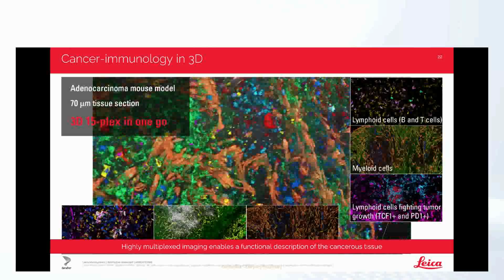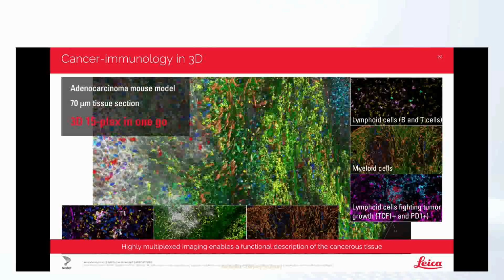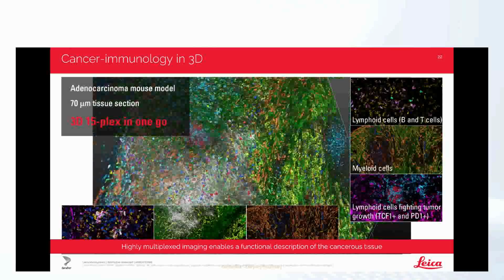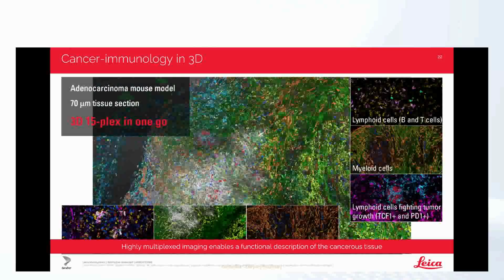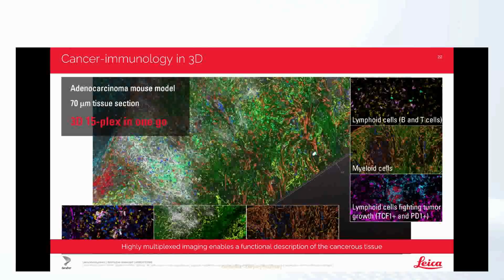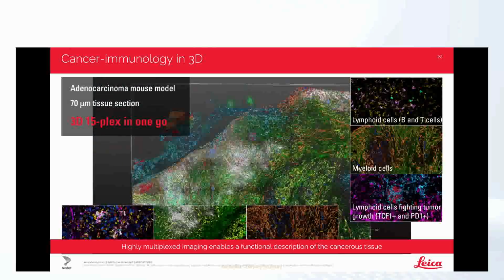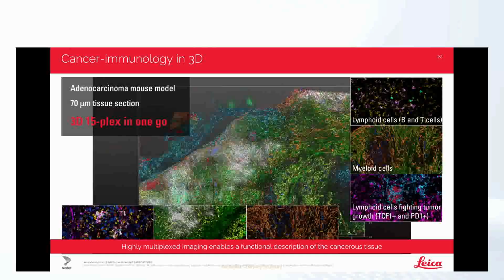So this is in 3D, but you may think, I don't need 3D, but what if you wanted to look at organelles? Then you would want the resolution that you can control with a confocal. Depending on the skill set of your frozen sectioner, the wide field-based systems do really well at 3 to 5 microns. When you're working with a new postdoc, they're usually doing 10 microns thick. So with the ability to occlude the out of focus light, you'll get much better segmentation of the data if you're using a confocal on those somewhat thicker specimens. So it really depends on what your goals are for which technology you might want to choose.